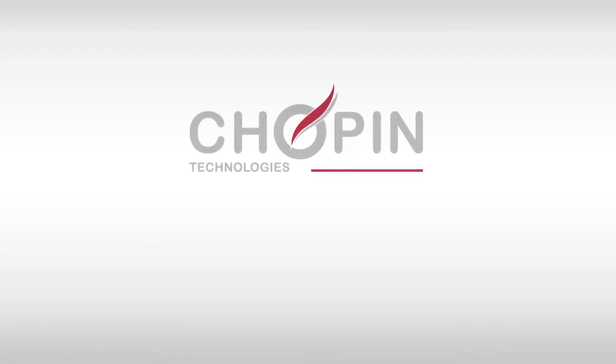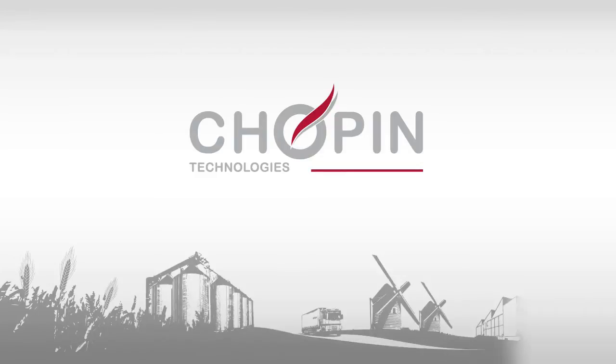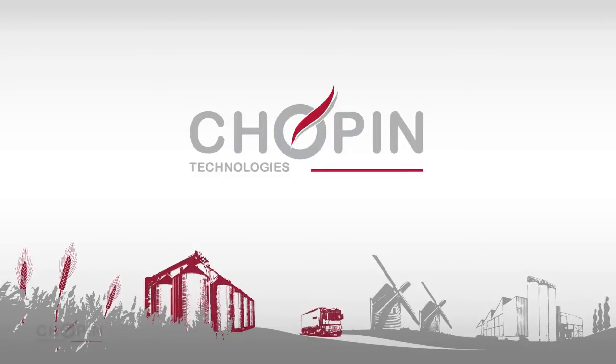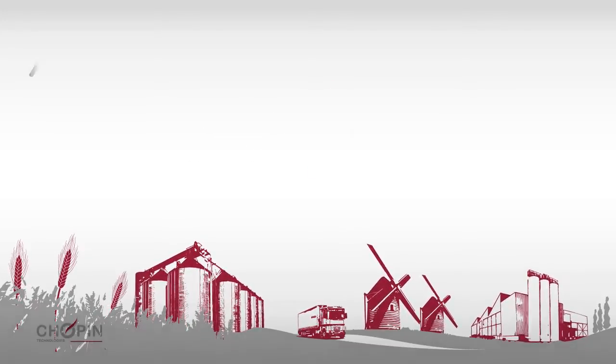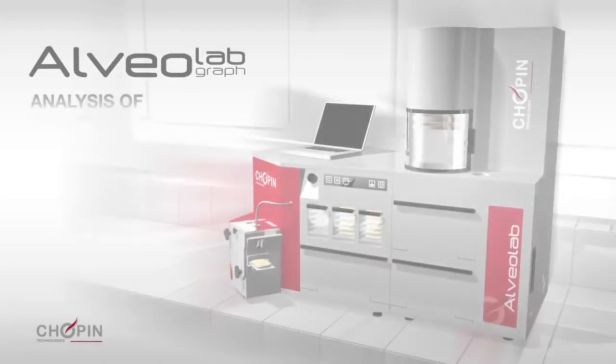For almost a century, Chopin Technologies has focused on providing the cereal industry with quality control tools and methods. Wheat breeding, grain storage, milling and baking industries use the alveograph on a daily basis to measure the viscoelastic properties of wheat flours.